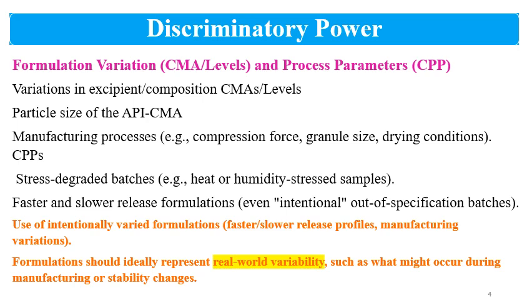The formulations which are containing insoluble APIs should be tested for dissolution, and the finalized dissolution method, which is the QC method, should be discriminatory, because the QC method is going to the plant from R&D, and that method should detect the good batches and the bad batches at the plant, so that the bad batches cannot enter into the market. So this was the brief information for the topic.